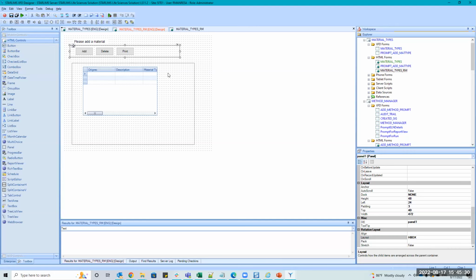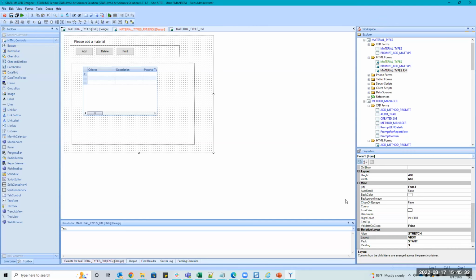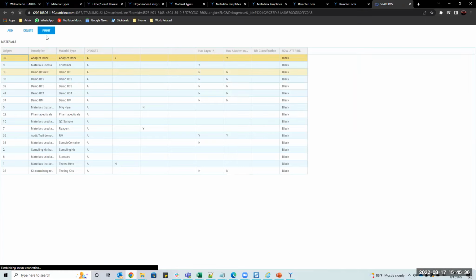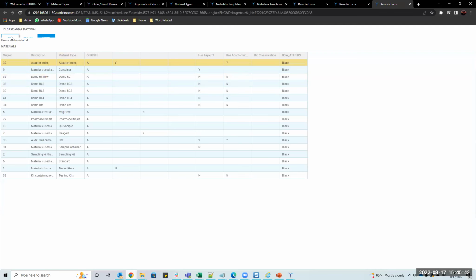So I use a lot of panels. Everything I try to put in panels. Everything is relative layouts. And then if things get misaligned or whatever, I use that push to back to get it to how it, yeah, you see, like this is, well, we're seeing 2 of them.